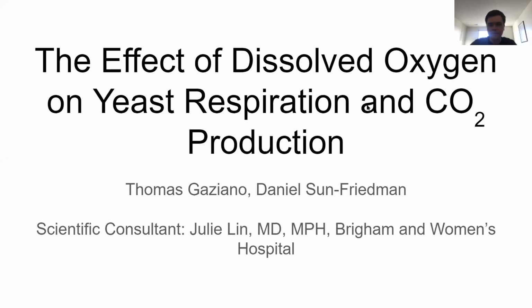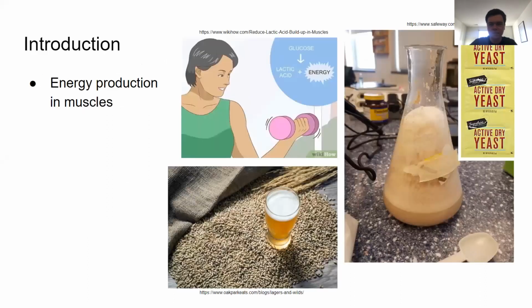Today we will be talking about our independent research project, the effect of dissolved oxygen on yeast respiration and CO2 production. We were primarily interested in studying the biological process that relates to our own human bodies.